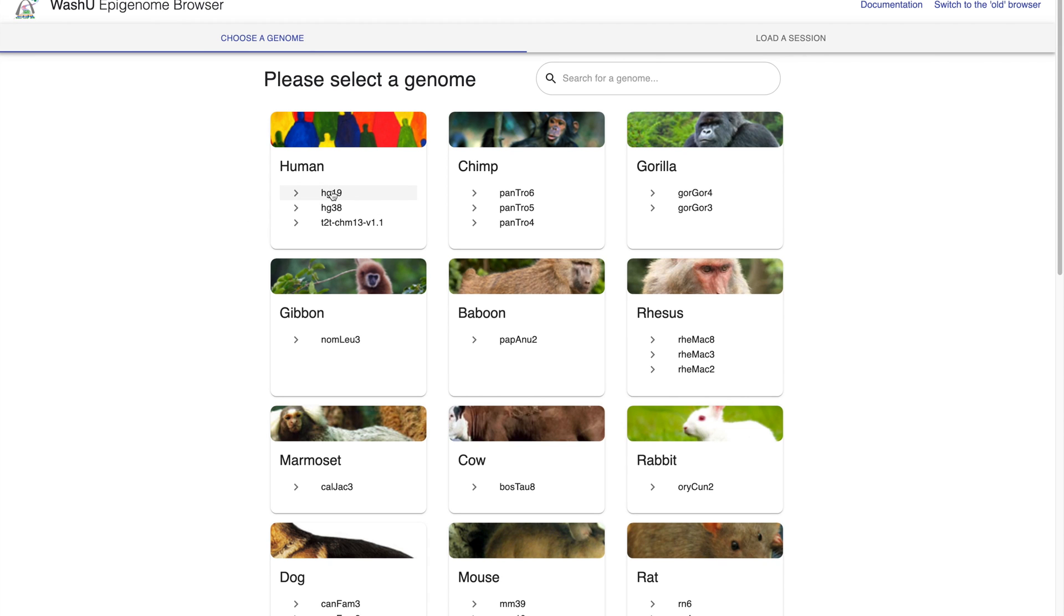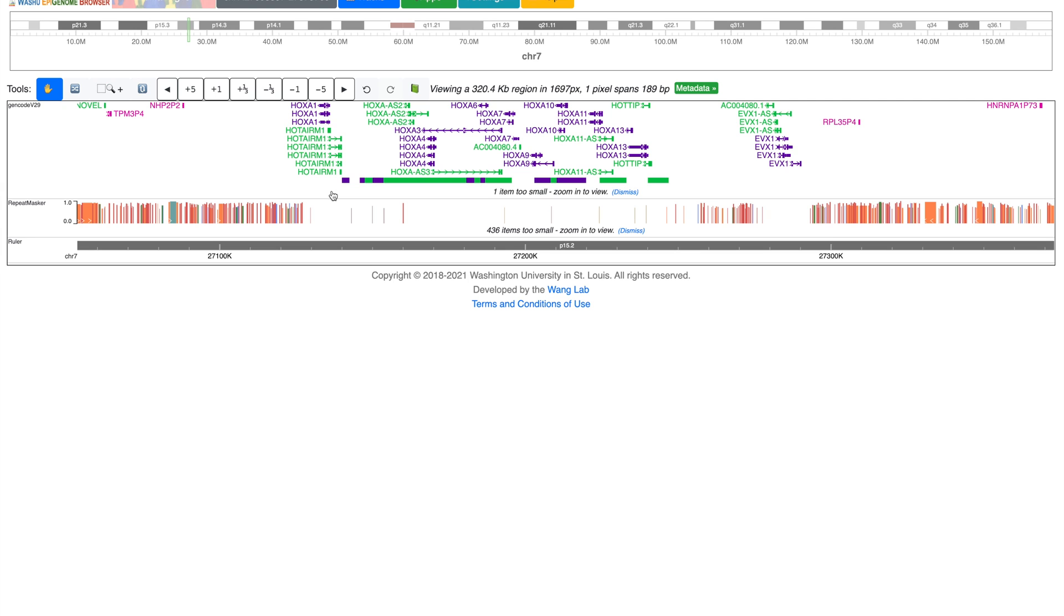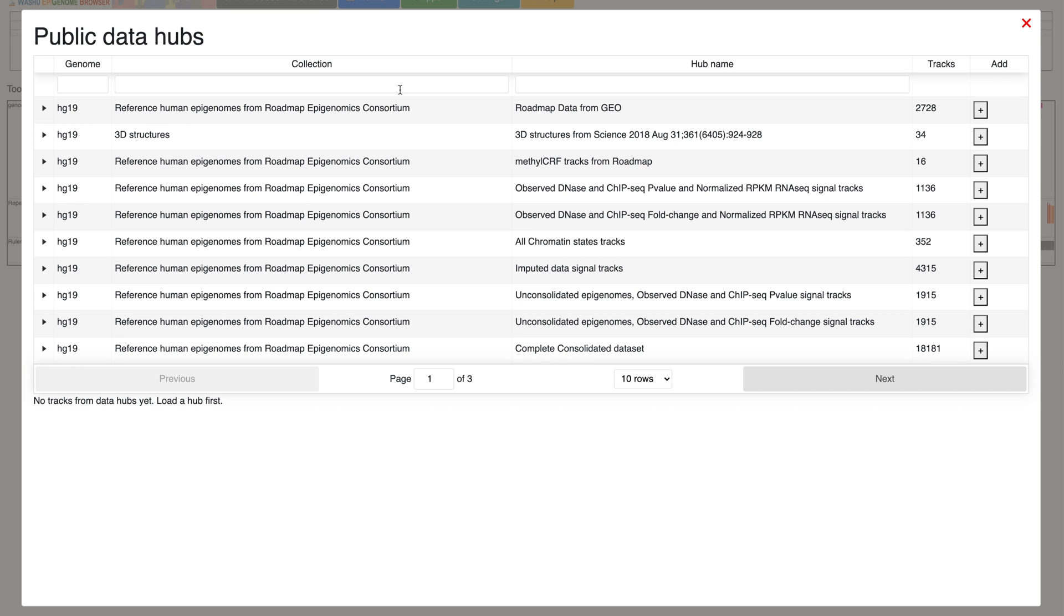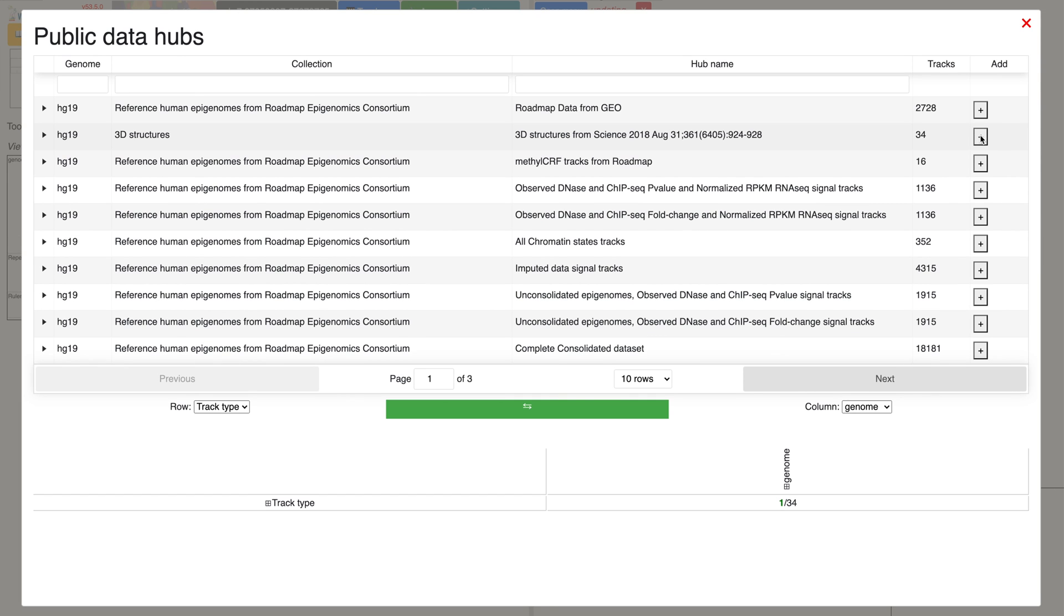Select the genome of interest to load the browser. Select tracks, public data hubs, and 3D structures to select the 3D track.